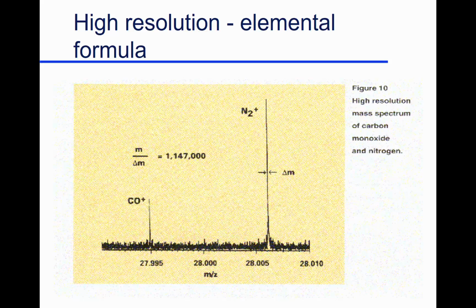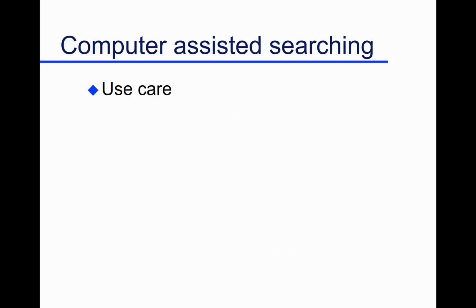And so it's really a powerful tool. The problem is they tend to be more expensive, and they take a little more effort. Most of the instruments you see around are low resolution instruments, but these are very, very useful instruments when you can afford them and need them.